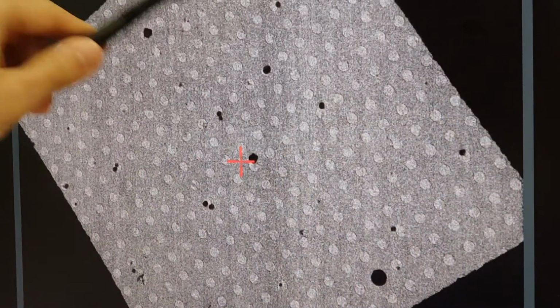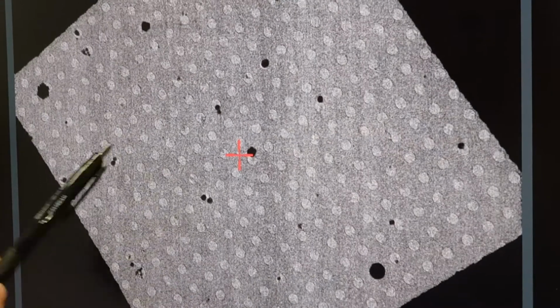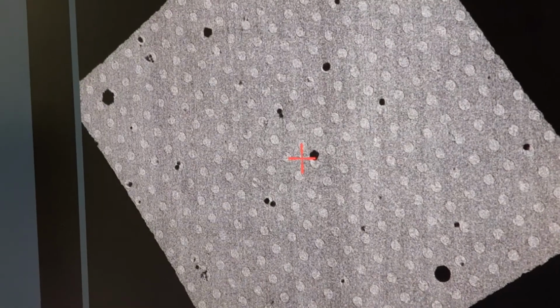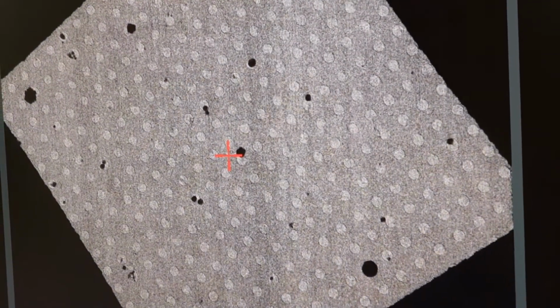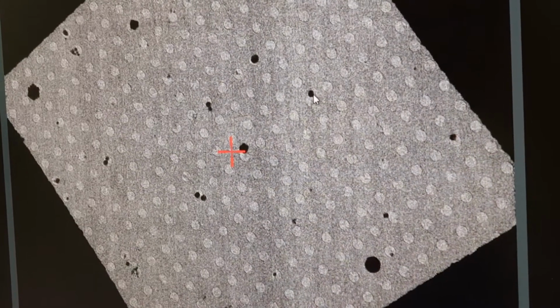You can see some of the holes, and on this carbon film, you can see small particles. Some of the particles may be smaller ice chunks, for example this one, which is hexagonal in shape. You can easily recognize them. And some of the particles are likely to be drug crystals. So we can target one of them and take a closer look. Maybe this one.